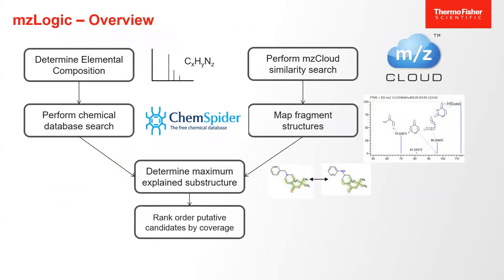And now, did we identify your proper compound? No, but we gave you a set of compounds to either purchase all five, the brute force approach, which sometimes is the easiest, or we gave you five structures which may have enough commonality for you to deduce what's different. What's the key word there in that last sentence? May.